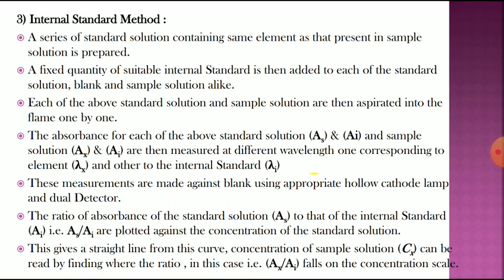That means for each solution we have to measure at a different wavelength. These measurements are made against blank using an appropriate hollow cathode lamp or dual detector.